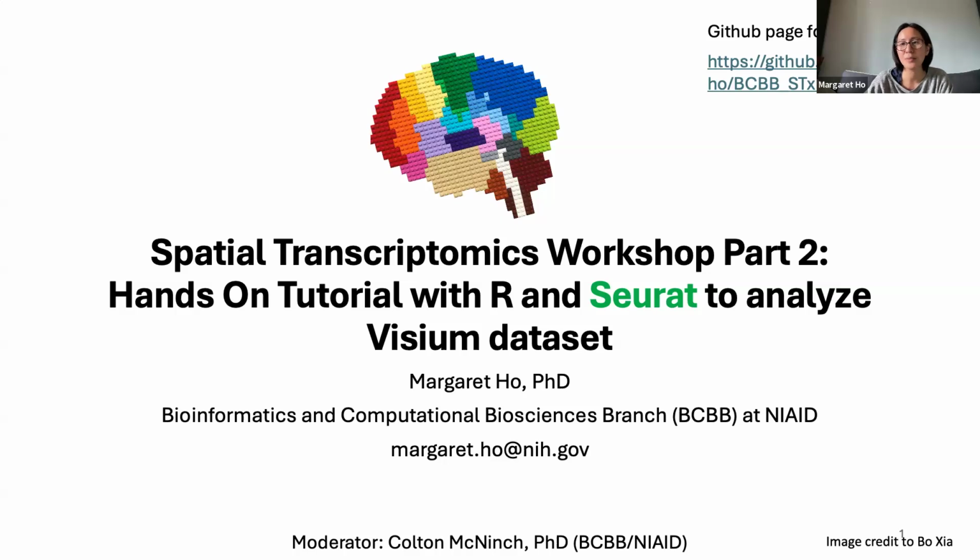Today's is a hands-on tutorial with R and Seurat to analyze an example spatial Visium data set. You should have gotten an email from me earlier in the week with a link to the GitHub page. I also put it in the chat. That has all the slides from part one and today's slides as well as our code that we're going to be working with later as well.